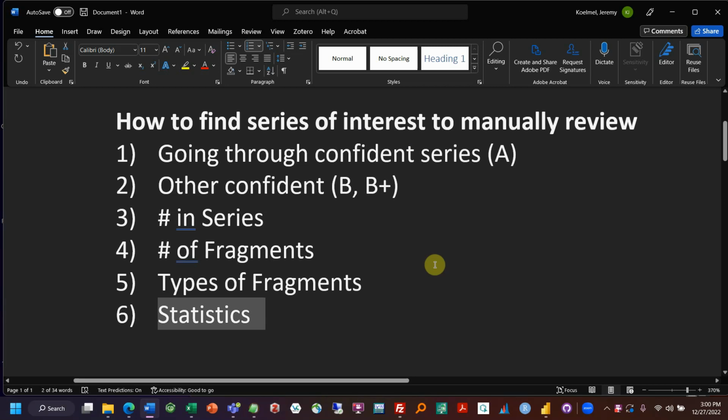So in this tutorial of part 2 of the visualizer, we're going to go through how you annotate chemicals of interest, and especially PFAS chemical series, using a 6-step process. Now, using the visualizer, you can do a lot more than just this. This is just the workflow that I've come up with to validate PFAS and discover new PFAS. So I'm excited to see the workflow that you come up with.